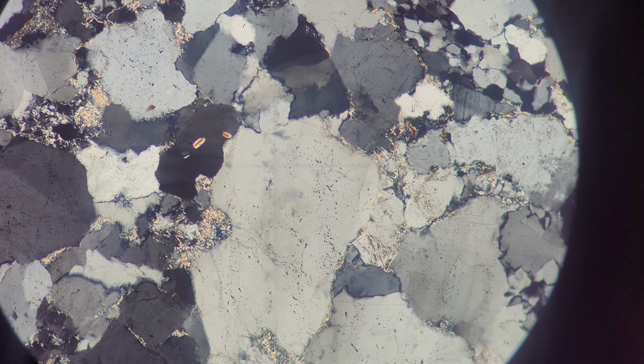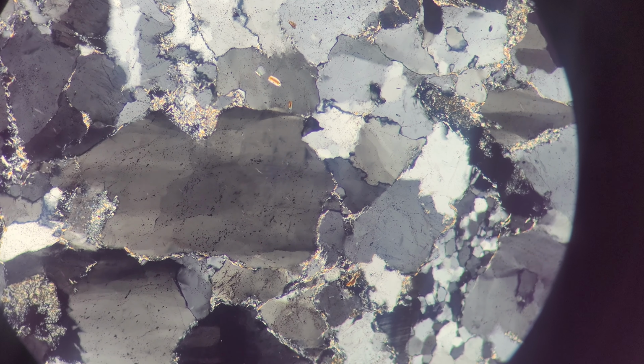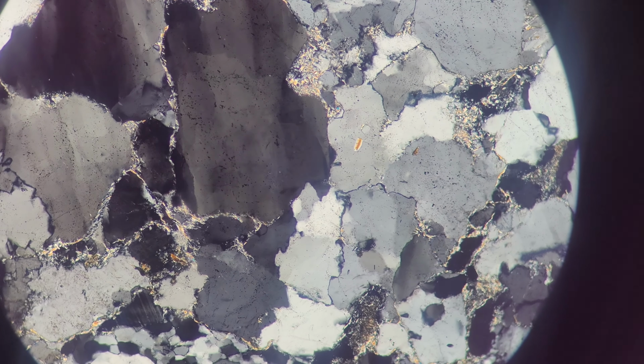Some minerals, namely quartz, exhibit undulatory extinction, where different parts of the mineral go extinct at different times during the rotation of the stage. This is due to deformation of the mineral.